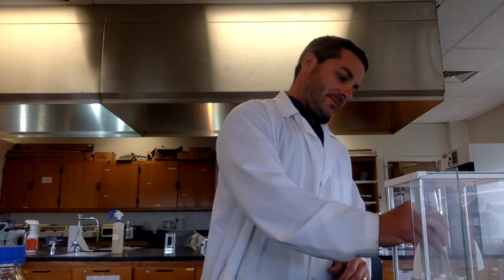The other density that we're going to find is of a liquid. We still need the same thing: the mass and the volume. For a liquid, the volume is pretty easy. We're just going to use a smaller graduated cylinder, put some volume in there and record the volume. The mass, however, is a little bit different. What we're going to do is take an empty graduated cylinder and weigh it. It weighs 34.712 grams. Write down all the numbers.